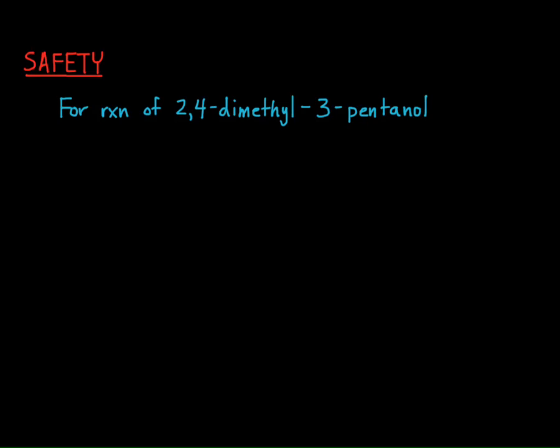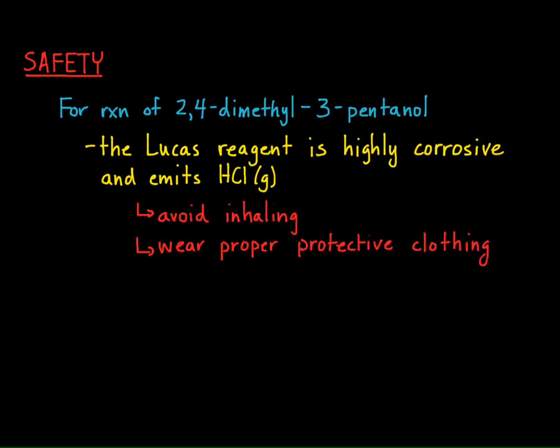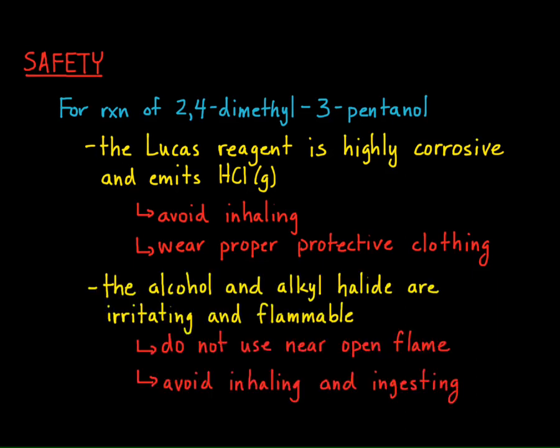For the reaction of 2,4-dimethyl-3-pentanol, you react the alcohol with a Lucas reagent, which is a mixture of zinc chloride and hydrochloric acid. The Lucas reagent is highly corrosive and emits hydrogen chloride gas, so avoid inhaling and protect your eyes, skin, and clothes. You will also want to treat the alcohol and alkyl halide in a manner similar to the one previously mentioned in the other procedure.